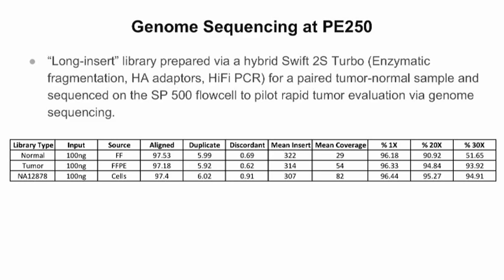mutational calls and correct for them. One of the ways we've done that, and I don't have the data completely prepared yet, is looked at that first from a variant calling perspective: we made the correction in the FASTQ files, or on a separate copy of the FASTQ files, and then ran them back through variant calling to see how much that actually influences it.